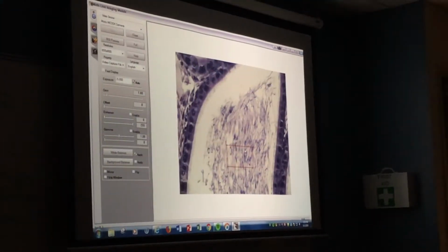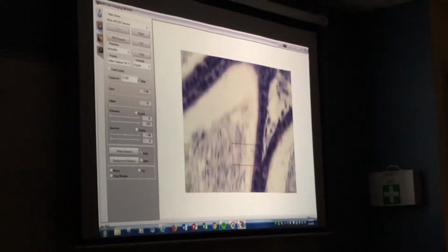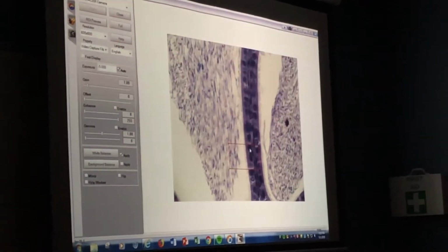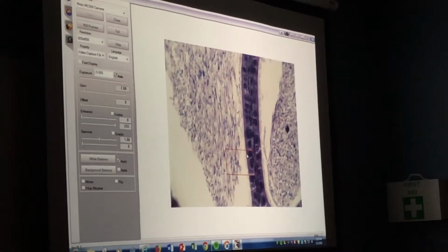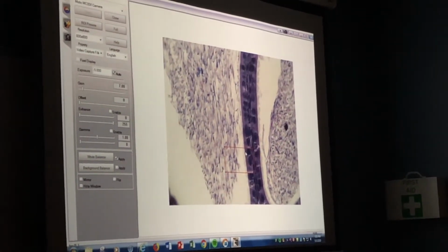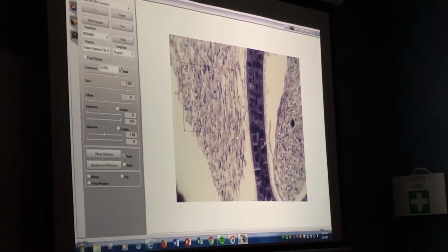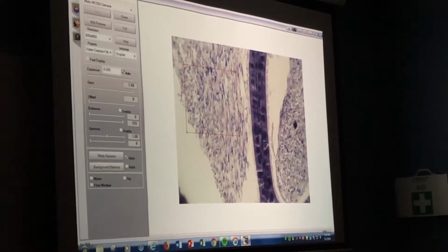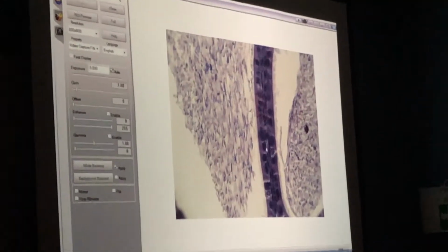On the slide with the testes, you can also see the epididymis, but when I was looking around quick, I didn't see one on that one, so let's pull up an epididymis slide. What do you notice that's different right away? Very clear definition between the wall and the sperm. Yeah, right, exactly. These are the sperm that are in the middle here. They're very distinct looking, they're separate from the wall, okay? How about the wall itself? What's different here?